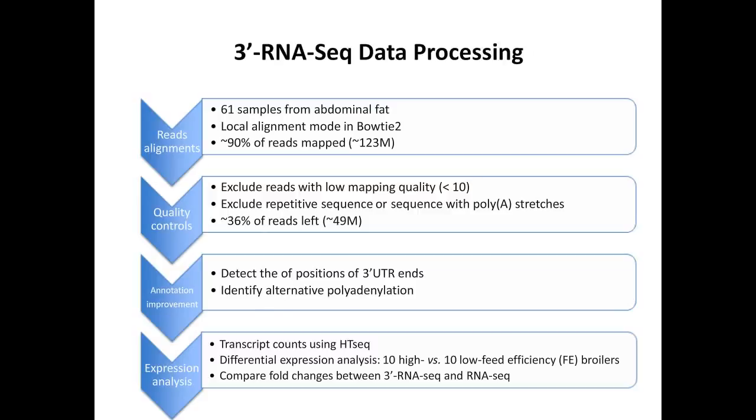Because, as I mentioned, we had both RNA-seq and 3' RNA-seq data, we used these two data sets to compare whether the accuracy is comparable between RNA-seq and 3' RNA-seq. For this analysis, we had 10 high and 10 low feed efficiency chickens.